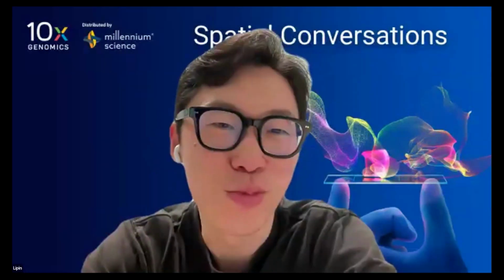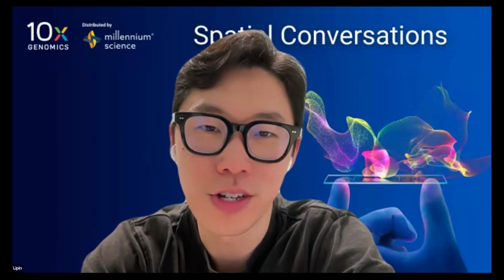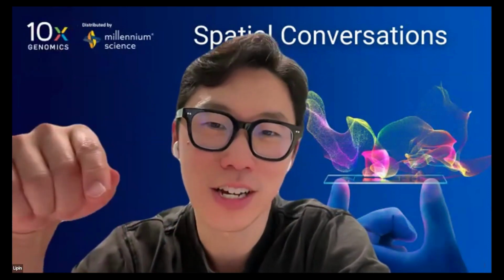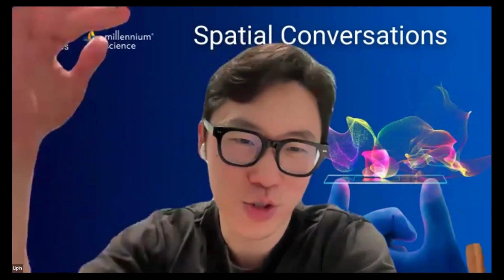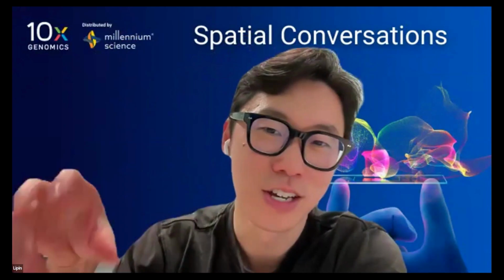Yeah, I think I mentioned this before. It'd be great if a lot of these downstream analyses could be built into the 10x Genomics cloud. So you finish your alignment and then you just click, I want to analyze with Seurat, and Seurat loads the package, runs everything on the cloud and gives us the results.